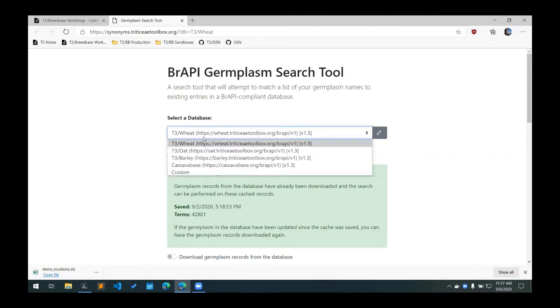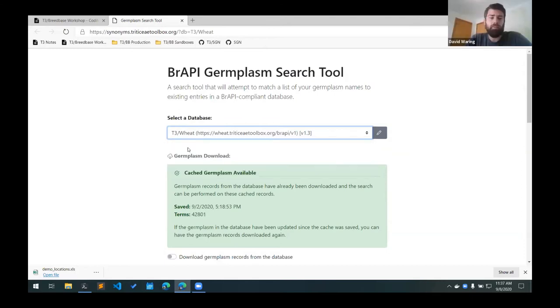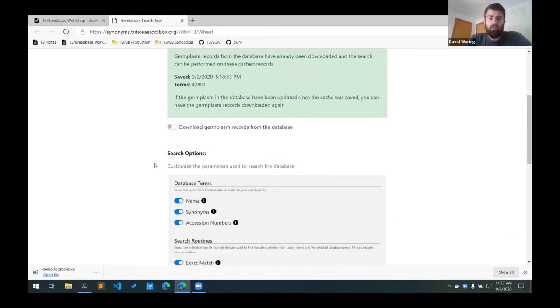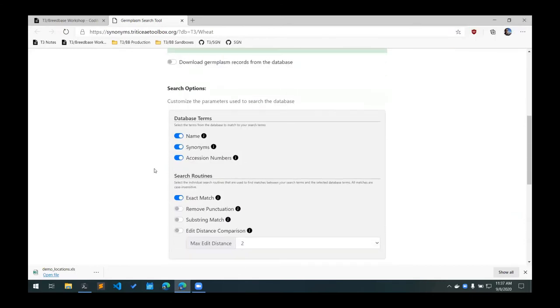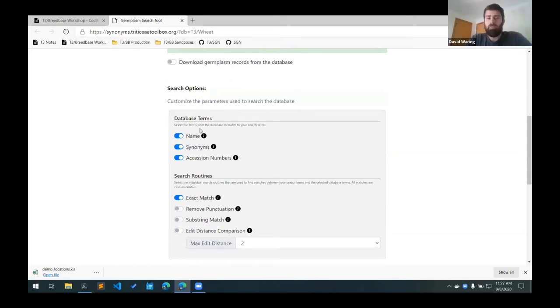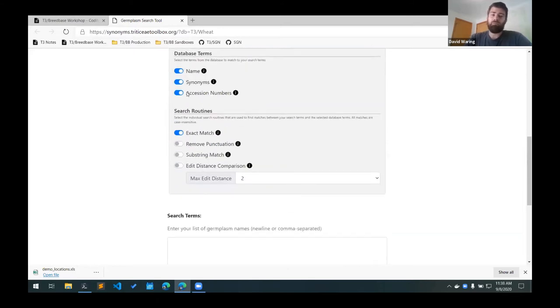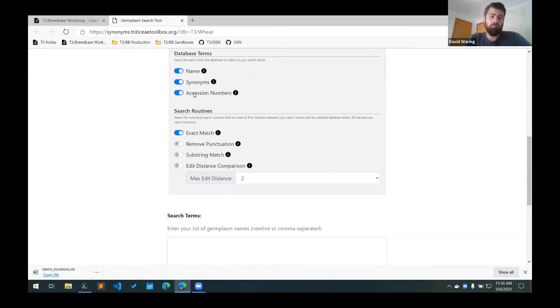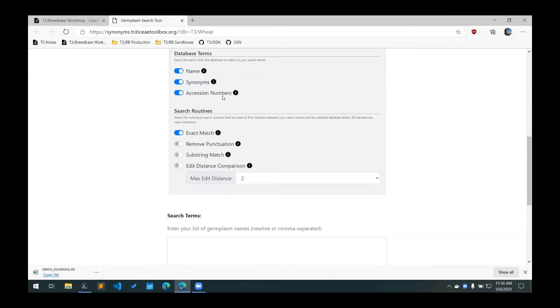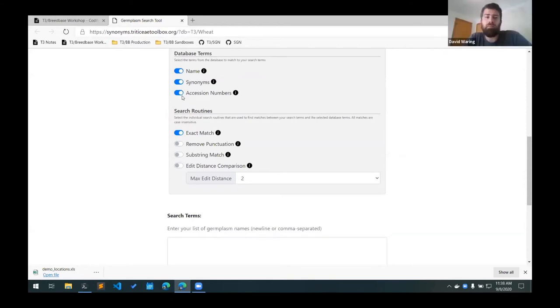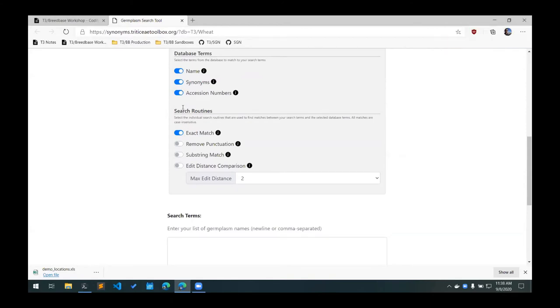So you can select the database that you're working with. And then the different database terms that you want to try to match with your search term. In the database, each accession has a unique germplasm name. You can also have alternate names that are listed as synonyms. And then if it has registered accession numbers, such as a GRIN PI number, you can search those as well. So you can toggle each of these database terms that you want to try to match to your search terms.